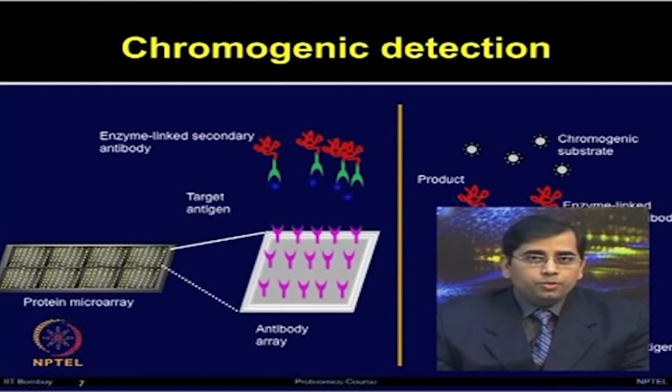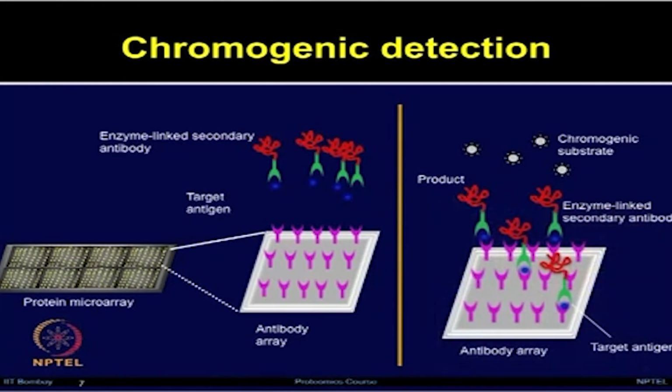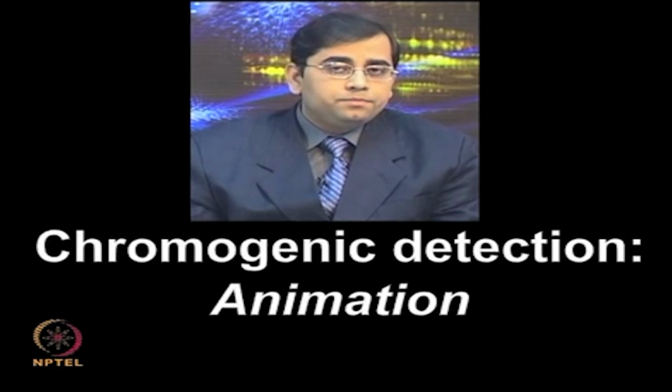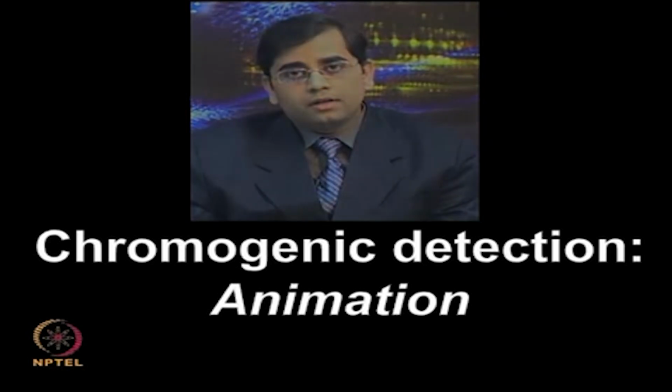Binding of substrate molecules results in colored product formation, which can be easily detected and quantified by means of a microarray scanner. Let us look at the chromogenic detection system in the following animation to understand the mechanism in more detail.